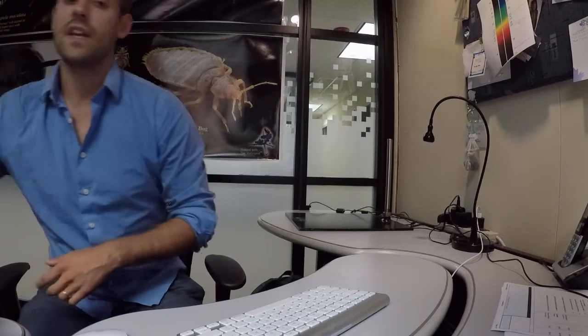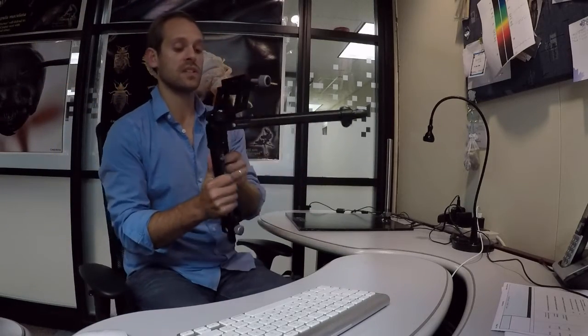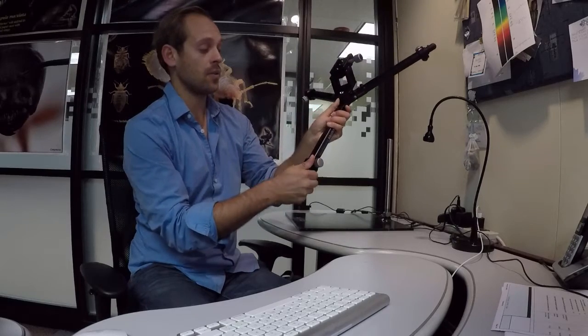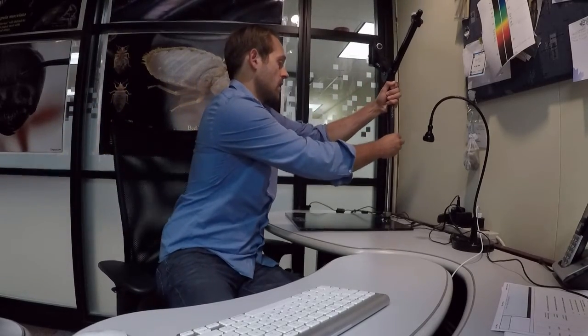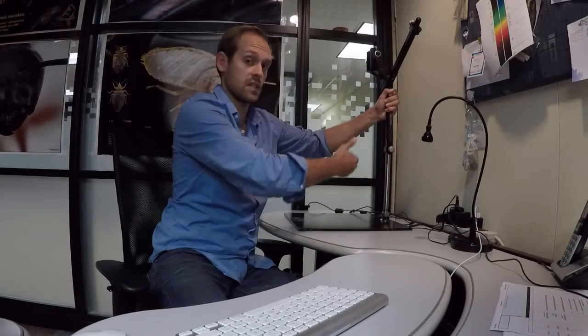Next, take the tripod and extend the back arms all the way to the 90-degree position, same with the front leg. Slide out the arm — you're not going to need it, just set it aside — and this tripod will slide directly down right over the stainless steel rod. Elevate it so you keep a good working distance between your sample and your camera.